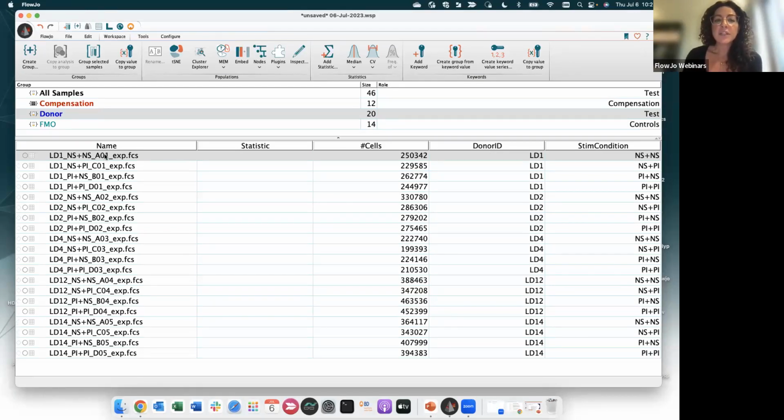Okay, so now that we finally have set the workspace, I know it's quite boring as a part, but it's the most important part, because if you set your workspace in a correct way, then you're free to go, and your analysis is fast and easy and much nicer, I would say.